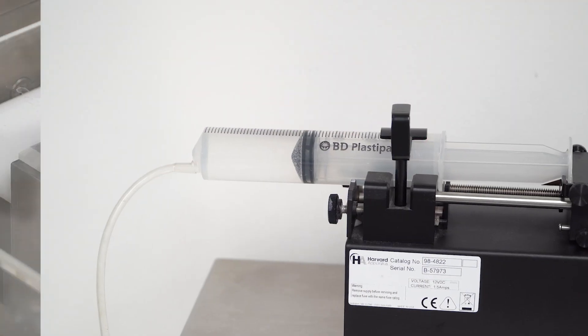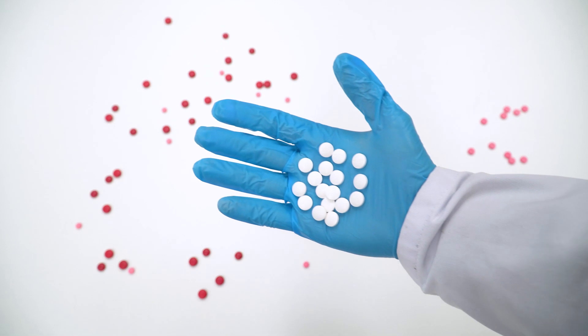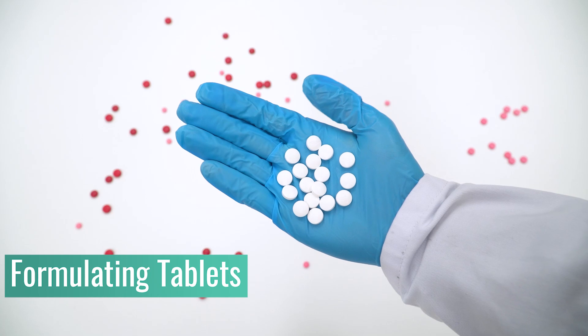Drastically shorten your formulation development time by quickly establishing liquid to solid ratios and optimal mix time. The MTR is a vital tool for accelerating tablet formulation, especially when your ingredients are expensive or in short supply.